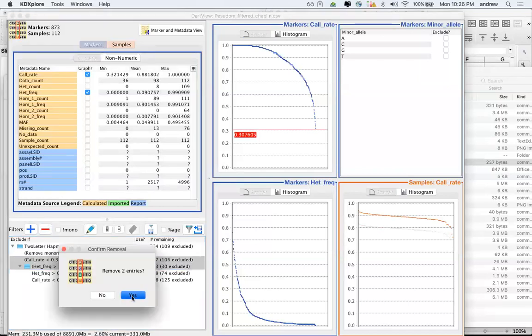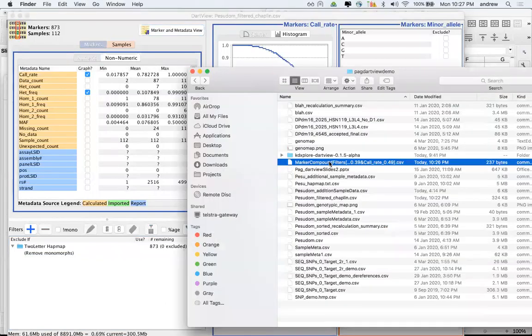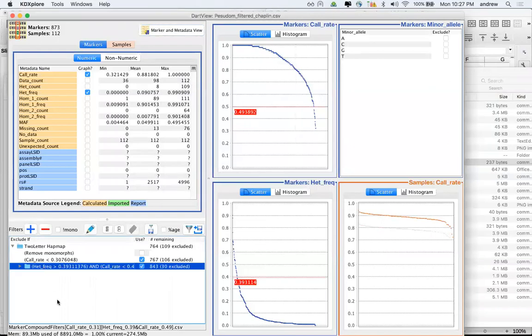So for example, if I was to come back to a new data set of the same population group in a year's time, I may wish to reuse the same filtering rules which I had used in my previous analysis. So I can just grab that filtering rule and drop it into here. And so that will repopulate those filtering rules for my new data set.